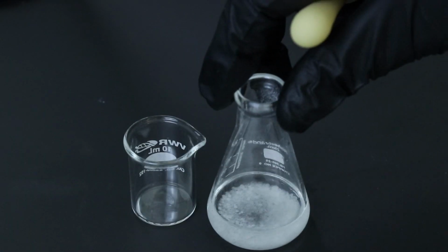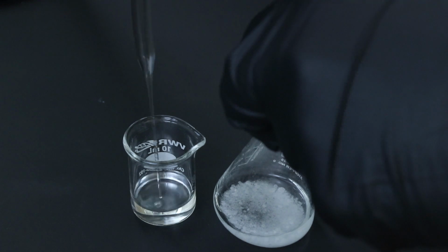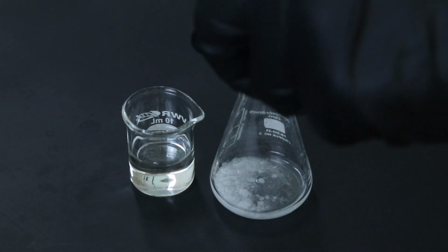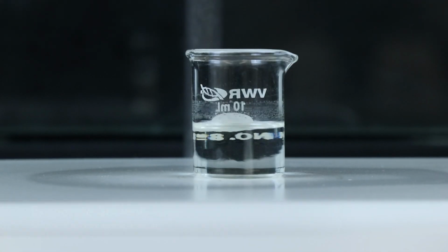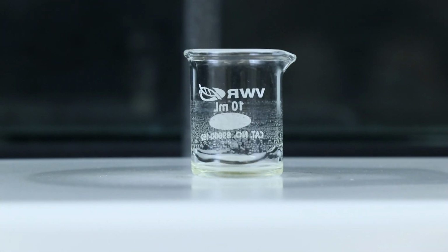Then I'll transfer that solution over to a beaker, and since I used quite a bit of methylene chloride, I'm transferring it to a beaker rather than a conical vial, although a conical vial would probably be preferred. And I'll rinse the sodium sulfate with some additional methylene chloride to help reclaim more product. The solvent can then be evaporated using a stream of air and gentle warming until just the cinnamaldehyde liquid remains.